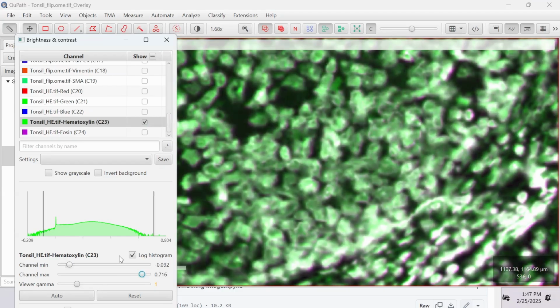I don't want to go too deeply into the weirdness of that image, because this is a 32-bit floating point image, and that's a 16-bit. So those numbers make very little sense right now, because some of them are negative and they go only around 0, and some of them are spread from 0 to 65,000. If you're interested in more in that, the 2023 edition focused a lot more on Brightfield images.